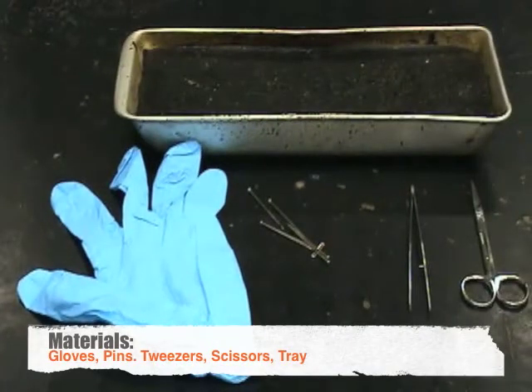First, gather your materials: scissors, gloves, a tray, and pins.